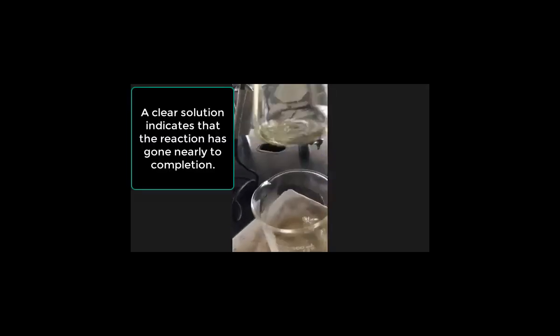We're going to regenerate that sulfuric acid at the end every time. This one is going all the way clear, right? So you can see all the acetic anhydride and salicylic acid has reacted. So it's all the way clear. So now once it goes clear, you just let it keep heating for another 5 minutes and it's good.